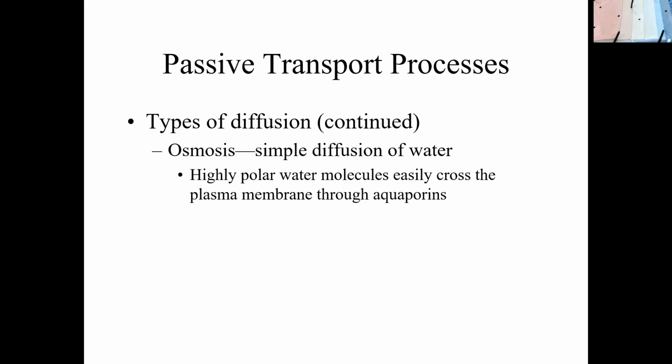Well, 0.9% sodium chloride, to make it, you would take a liter of water and you would take 9 grams of table salt to get to 0.9%.